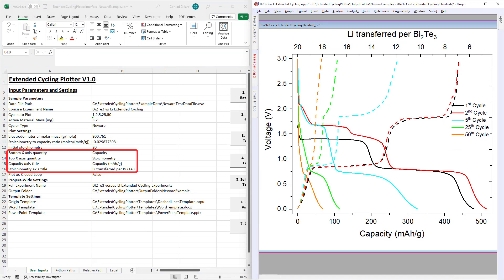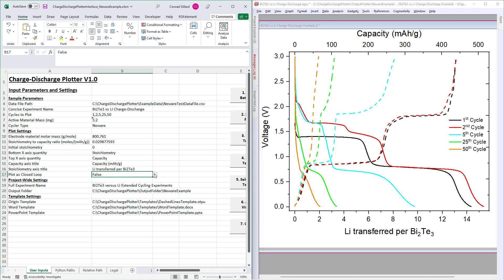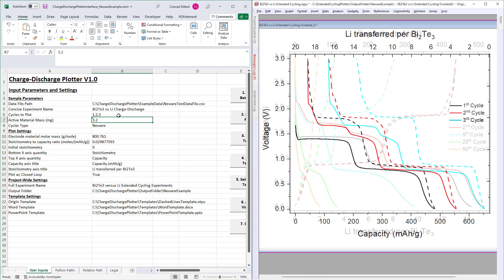Next, enter the quantities that you wish to plot on the top and bottom axes, and the titles that you wish to appear for each of these. Next, specify whether you wish the graphs to be plotted in a closed loop form. This is a format of graph that is typically used when consecutive cycles are plotted.